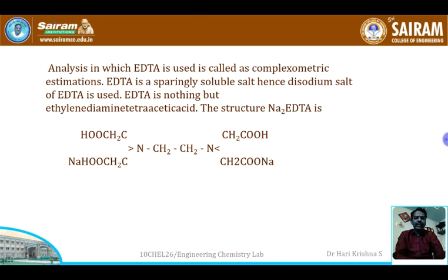pH will change. So in order to maintain the pH constant, we are going to add ammonium chloride buffer. So what are we going to add? We are going to see later. But I'm telling you here itself. In order to maintain, you can see that H here, right?